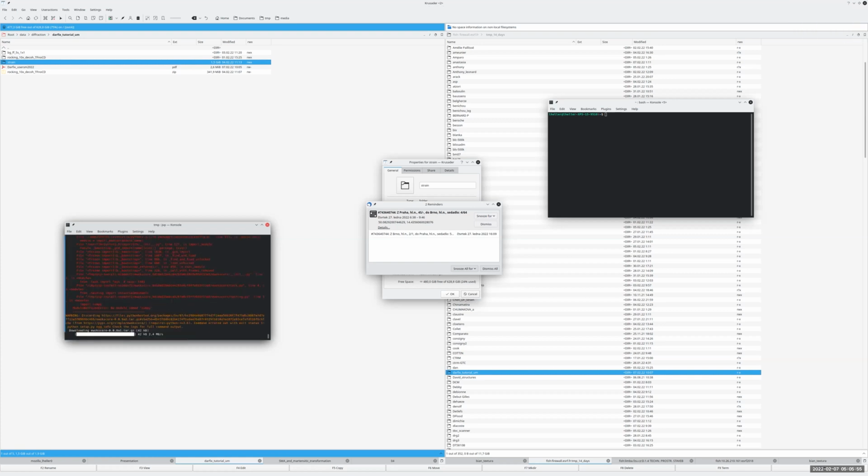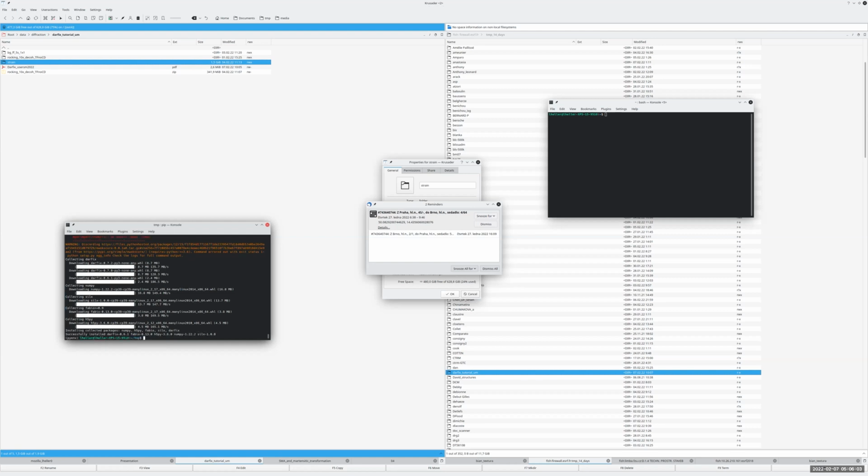No. Okay. Well, I met. The ebooks are inside. No. I observed some DC errors even on Friday, but it ran. So okay, it looks like it's installed. I don't know which version it says it's installed of Darfix, 0.6.1.